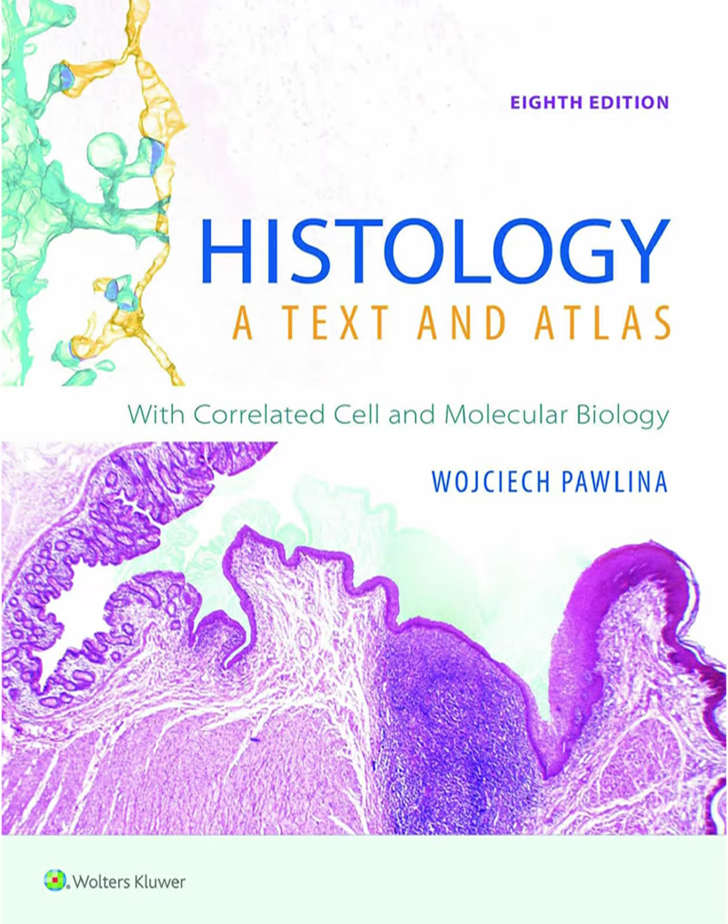It really is. We can also use enzyme digestion as a control. A control? How? Well, say you think a PAS stain is showing glycogen. You can take an adjacent, identical section and treat it first with an enzyme like diastase, which specifically breaks down glycogen. Then you do the PAS stain. If the magenta staining disappears compared to the untreated slide, you've confirmed it really was glycogen. Clever, like erasing the target.